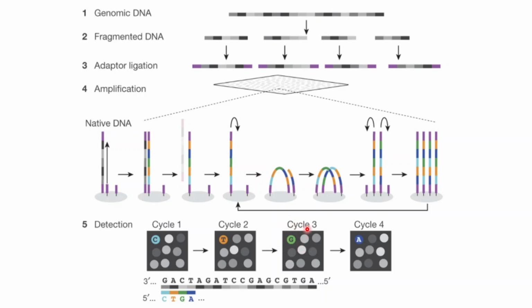So it gets a photographic image of the whole flow cell, and based on the intensity or the color at different time points, it is mapping out the read. So that gives you an idea of which sequence is getting added and what will be the probable sequence of this particular read, or the whole length read that is generated there. So from the color difference at different time points, you are generating the read sequence.